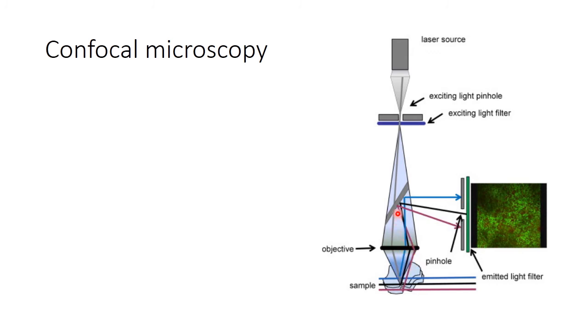These light rays are going to be transferred to the lens of the microscope through a pinhole. The position of the pinhole is adjusted in such a manner that in this illustration only the black ray of light is going to pass through the pinhole. The other rays of light, the red one and the blue one, are going to be blocked by this pinhole.